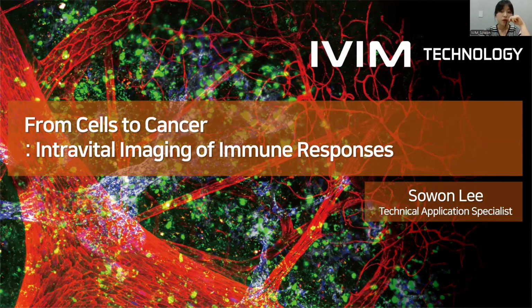In this webinar, I will present data obtained using our intravital microscopy system to visualize immune cell dynamics, and then move into a key application area where this technology is used extensively, such as studying anti-tumor immune activation. I will share both representative research cases and the types of data we can generate with this approach.